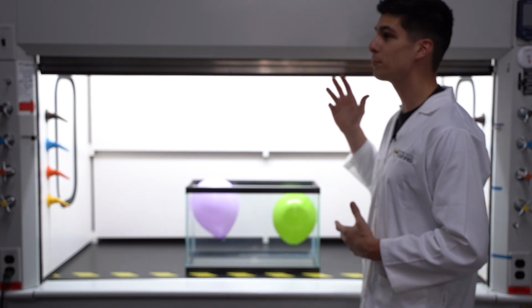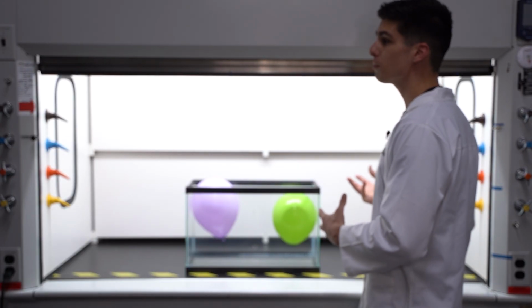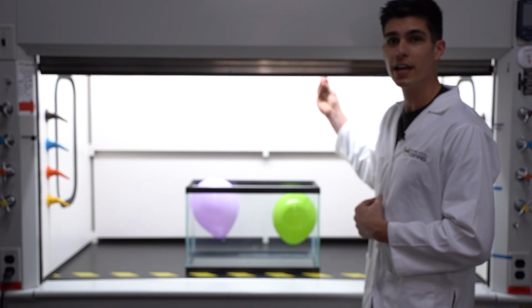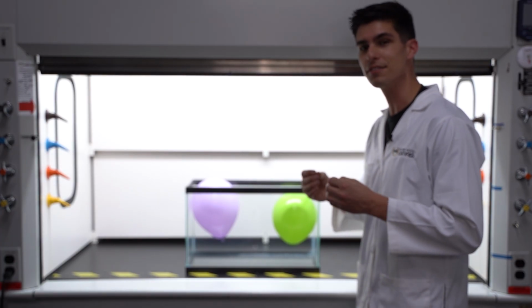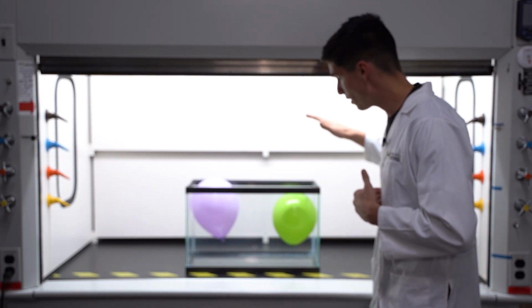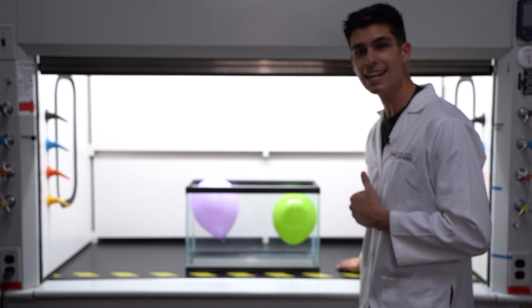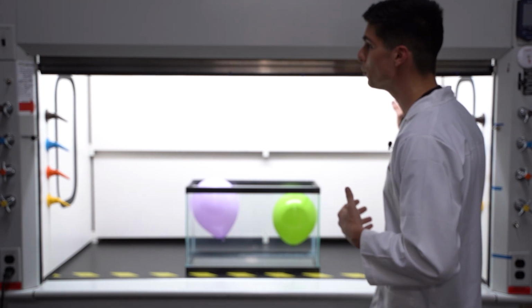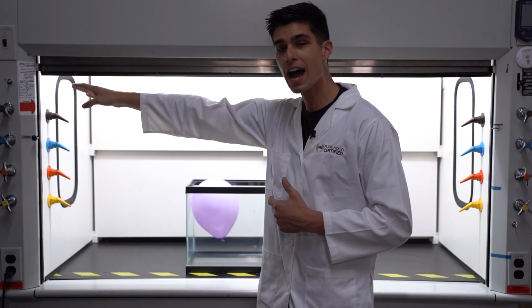So now we've turned the fume hood on and the fan is running. And it's supposed to be sucking all of the fumes and all of the air inside the chamber out of the building. Now the problem with testing with SF6 is that it's so heavy that oftentimes all of the SF6 falls right to the layer of the work surface, and it'll stay down here. And it leaves you vulnerable when you want to test the upper vortex of the hood, maybe some of the sidewalls in the hood.